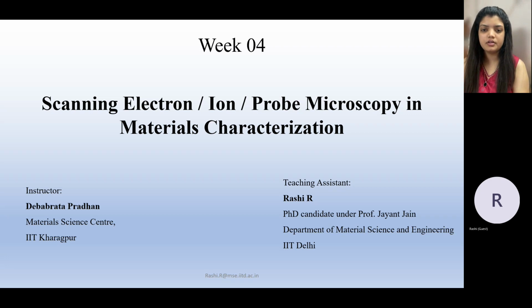Hello everyone, good evening. I think we waited till 6:07 already, so we can get started now. There were a couple of requests from the previous class that they wanted to learn about EPMA, that is WDS. So I told them that I'll be teaching a couple of lectures on that as well. Let's get started. Before solving the problem, I'll teach a couple of slides regarding EPMA.